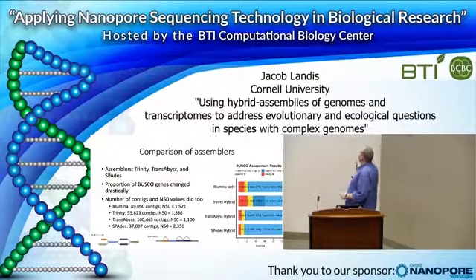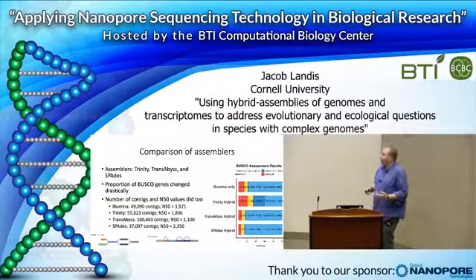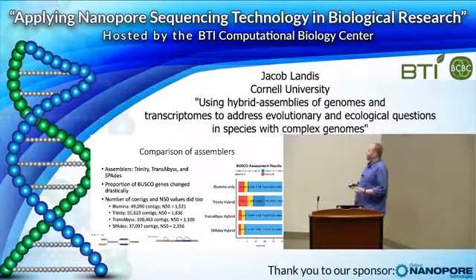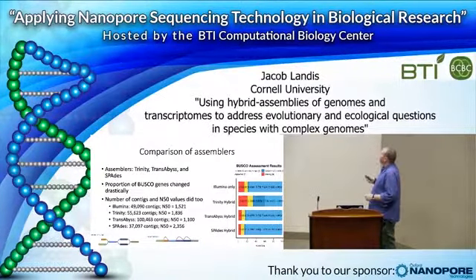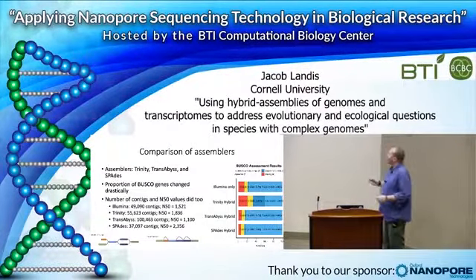We have the proportion of BUSCO genes from Solanaceae with the different types of data and different assemblers. And so we do see quite a bit of change in BUSCO score. If we look at just the Illumina data, the blue is complete genes. We see mostly blue, but we have about 400 and some missing BUSCO genes completely.